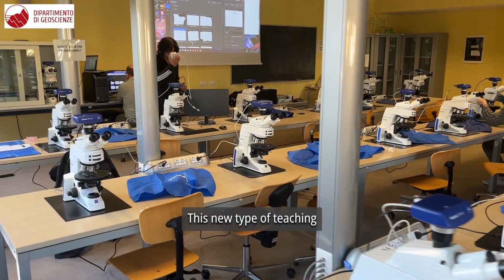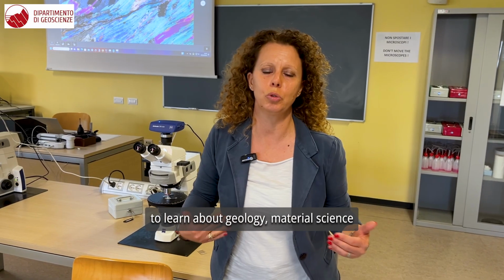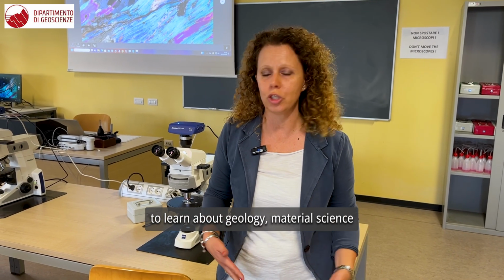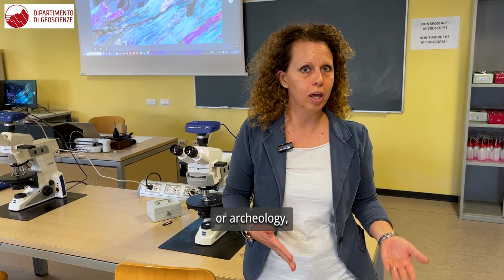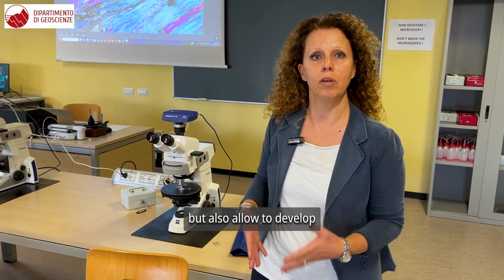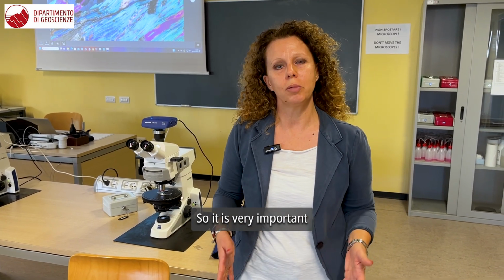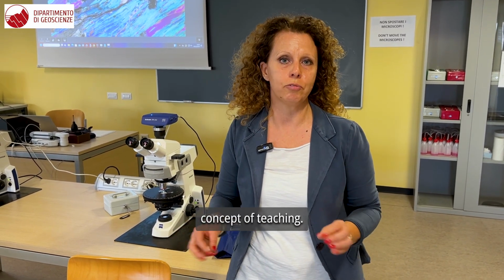This new type of teaching is very important for us since it not only allows the student to learn about geology, material science, or archaeology independent of the teaching course, but also allows the development of the soft skills of the student. So it is very important because it's a new, modern concept of teaching.